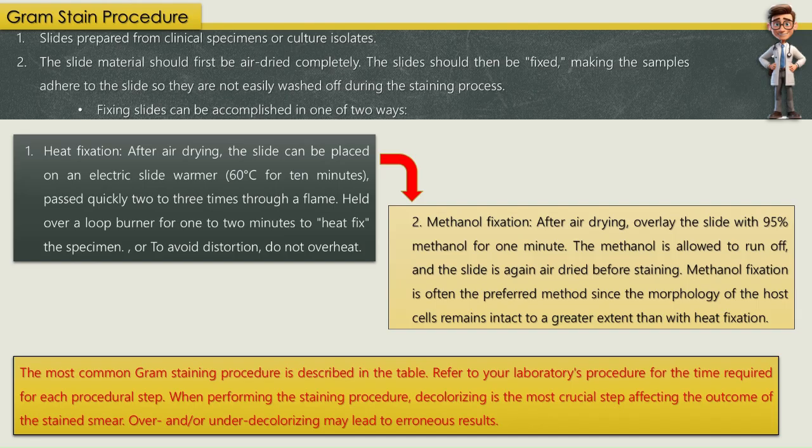Refer to your laboratory's procedure for the time required for each procedural step. When performing the staining procedure, decolorizing is the most crucial step affecting the outcome of the stained smear. Over and/or under decolorizing may lead to erroneous results.